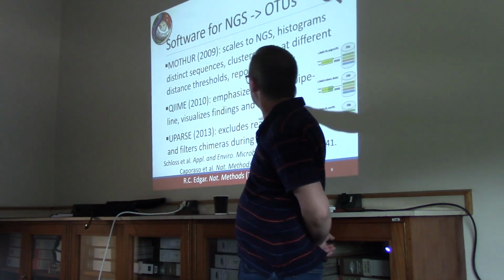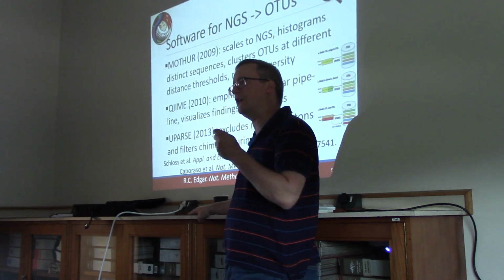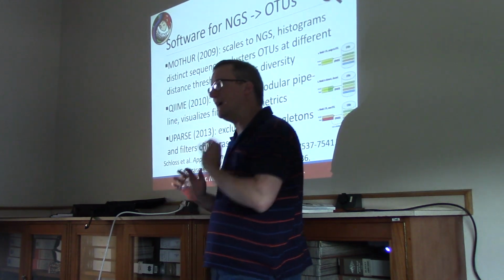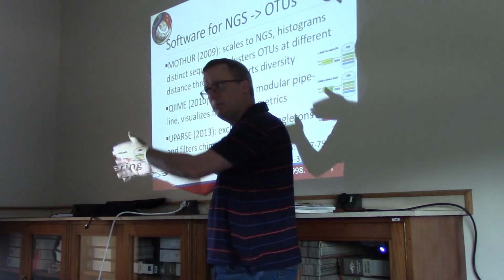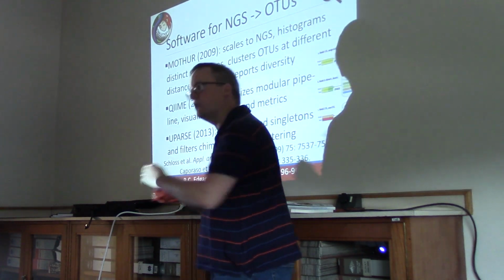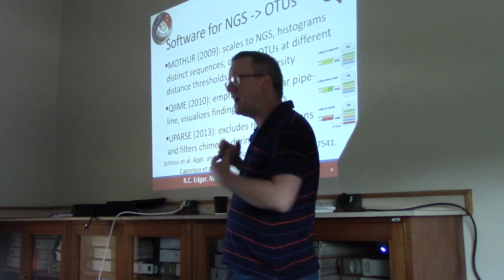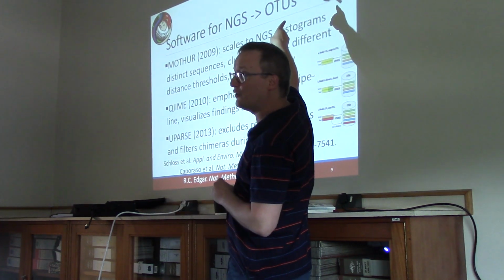All right. So one of the nice things about QIIME was that their emphasis was not on use our software or go away, but rather creating a framework with different approaches we can use for computing similarity. Pick the one you want. We have different methods available for handling the clustering. Pick the one you want. We have different methods for doing visualization. So QIIME is a framework. It's a modular framework allowing us to substitute out the various pieces. Here we've got their logo up here.